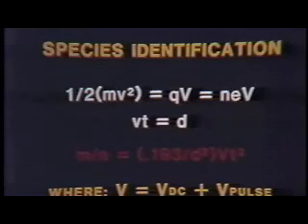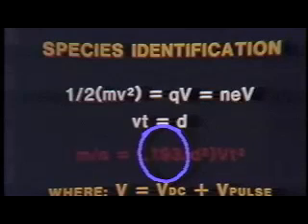You can do a lot of clever things. You can adjust your distances, for example, so that this becomes the year in which you did the experiment. There are all kinds of variations of time-of-flight mass spectroscopy that are possible.